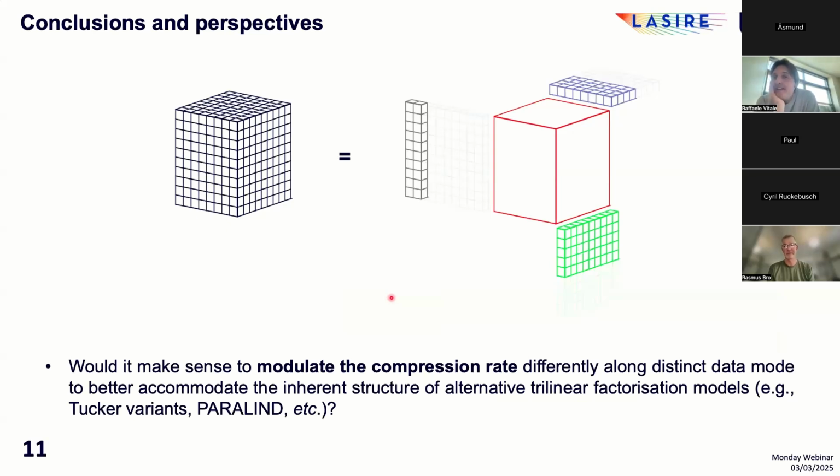In my opinion, at least as far as the algorithm is coded and the approach is proposed, we are not really able to handle automatically peak shifts or band shifts, because this constitutes a breakage of the linearity, so it goes a bit beyond the rationale of the algorithm itself, and it enters the more fundamental question of multilinearity properties.